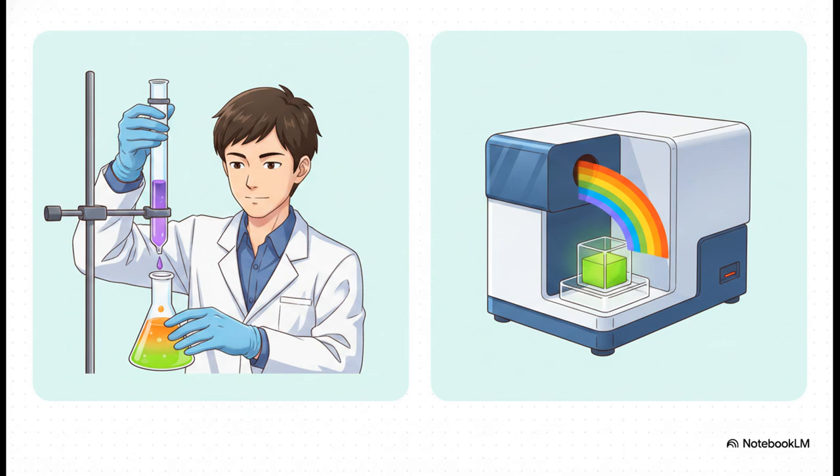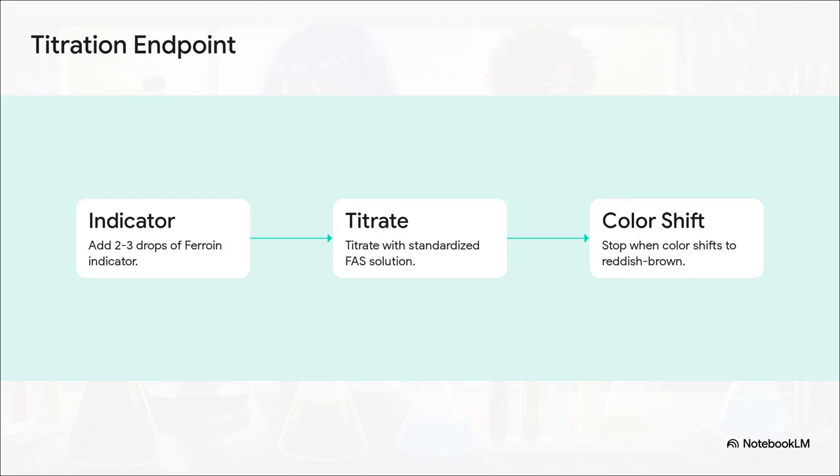The more modern colorimetric method uses a COD photometer to directly measure the concentration of the newly formed green chromic ions. But for our classic benchtop explainer today, we are going to use the titrometric method. We're going to manually measure the unreacted, leftover dichromate using a careful titration. This is honestly the most satisfying part of the lab.